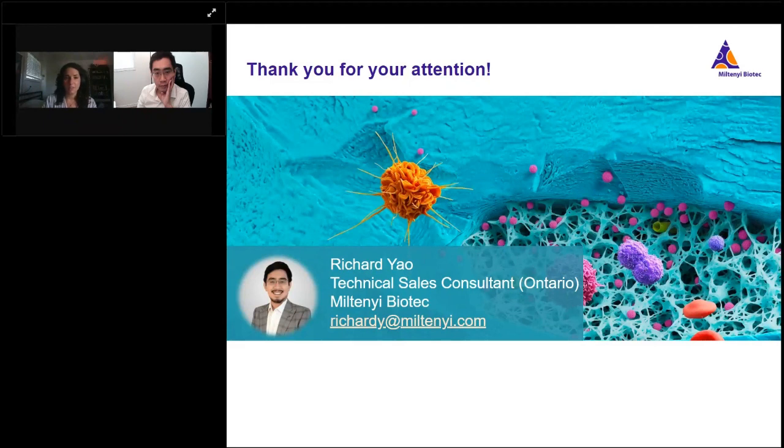It says, do you need to do a PBMC isolation first before a CD34 isolation from blood, or is there any way around this? Yeah, that's a really great question. So we do have straight-from-blood beads that are able to directly target cells from the blood for certain types of populations. But we don't have one for CD34 yet.